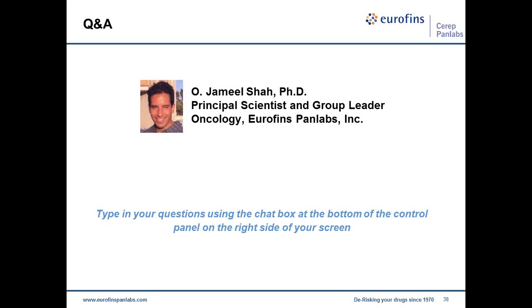We identify gene expression changes that relate to drug response after the 7-day incubation, and these gene expression changes are defined before the experiment even begins. So while there are probably some gene expression changes that take place, there are probably others that do not.